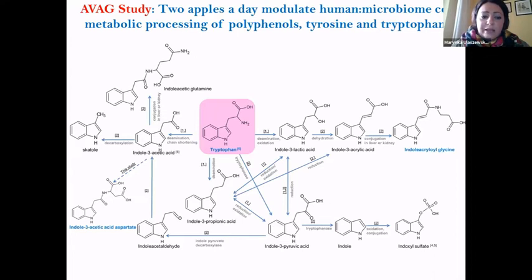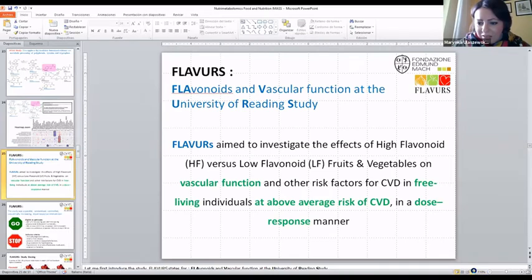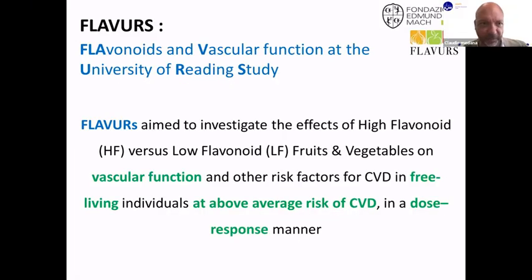But when we talk about the untargeted assay, I would like to show you these few graphs showing the metabolites that were found statistically significant. Some of them belonged to the tryptophan pathway, like here marked in the blue color. So the tryptophan, the indole, acryloyl glycine, and the... can you see this one? Yes. I will go very fast.